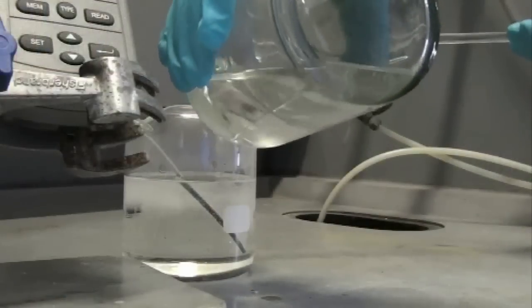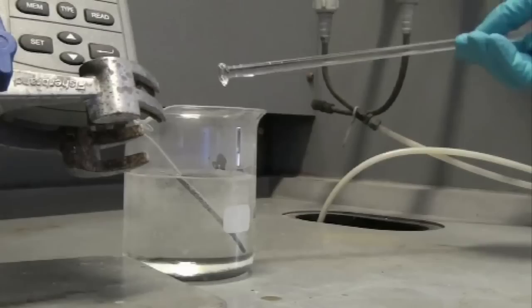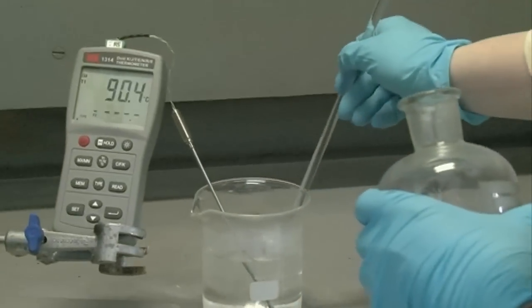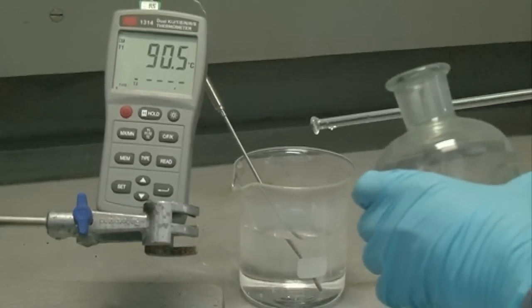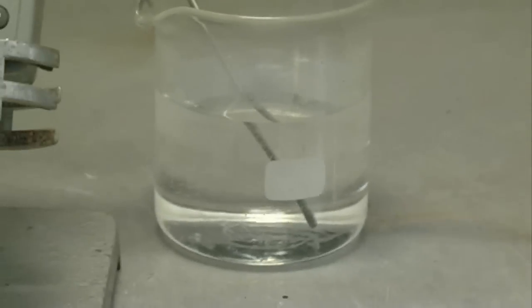So it's really important, if you're trying to dilute concentrated acid, that you take the water and add the acid to the water, gradually making it stronger, rather than taking strong acid and adding the water to try and make it weak. That's quite a bit. I think we're getting to boiling now. So what have we hit? 97 degrees C. And you can see that it's starting to boil the water.